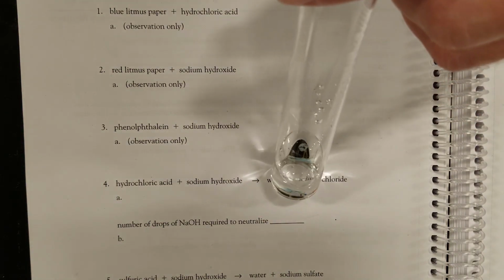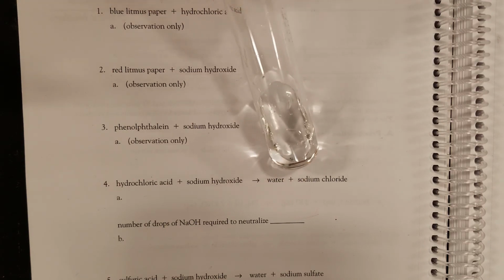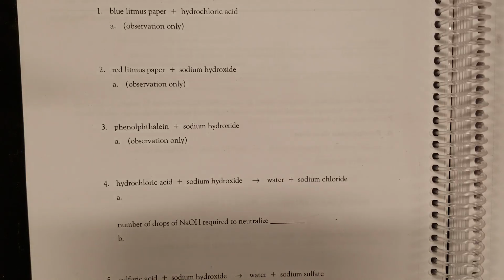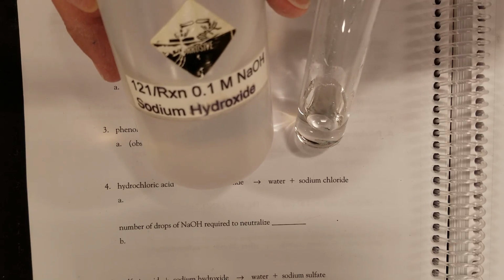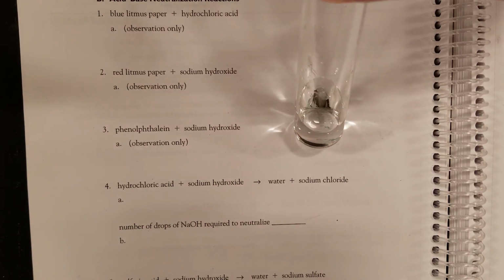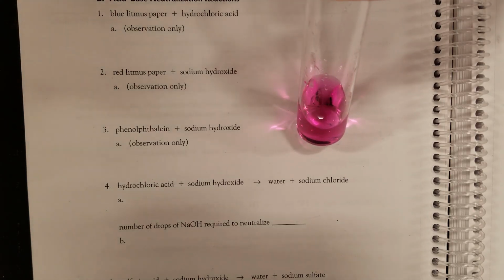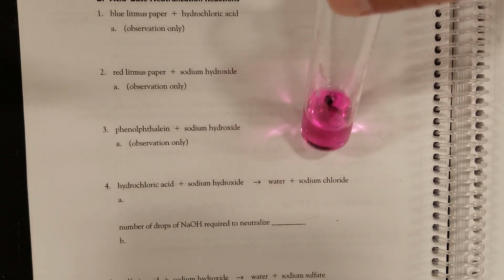Phenolphthalein is an indicator. So, in just straight water, it's quite colorless. In the presence of an acid, it's colorless. In the presence of a base, it turns pink. So that's our phenolphthalein. We're going to add a drop of our base, our sodium hydroxide, and you'll see that as soon as that sodium hydroxide hits the solution, it turns pink. So, in the presence of a base, phenolphthalein turns pink.